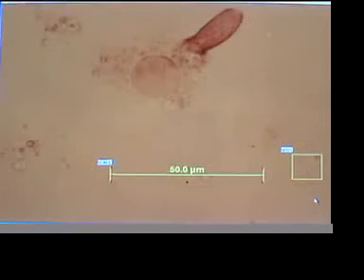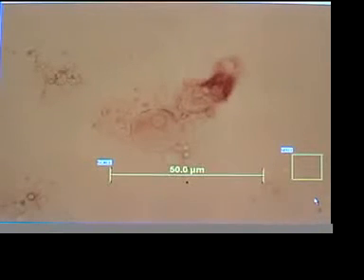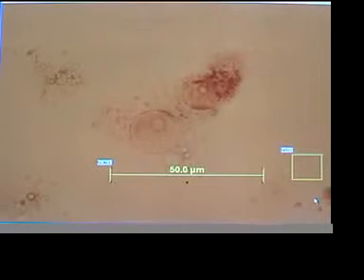Okay, we have another customer. We're having a great night here, filming devitalizations. This is live, in real time. I'll try to sharpen the focus a little bit for you. The scale is correct. This is about the 6th or 7th major reaction we've seen tonight.